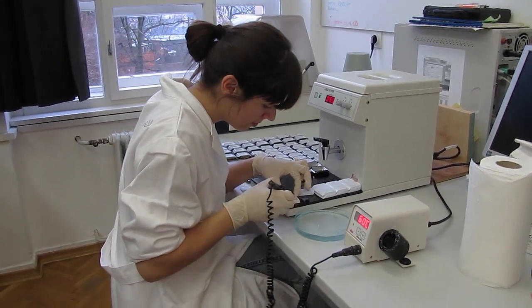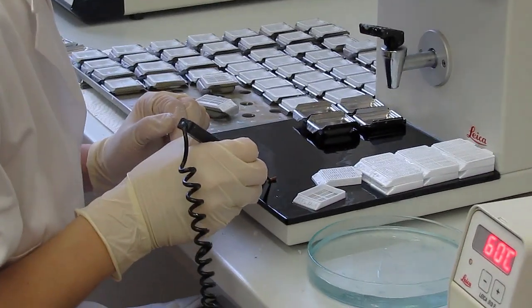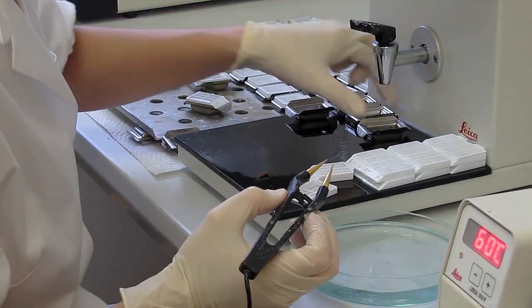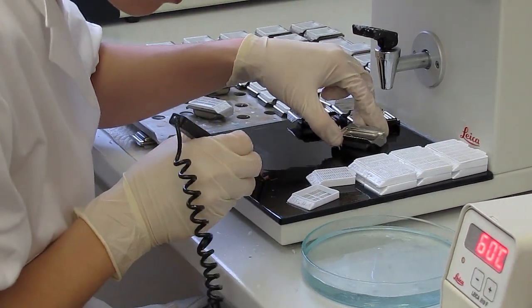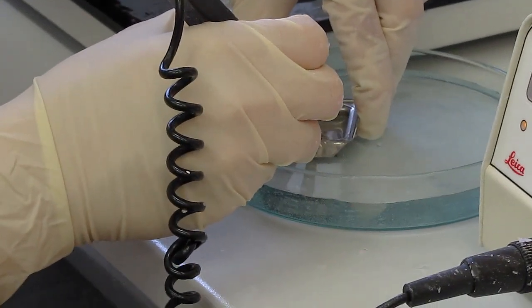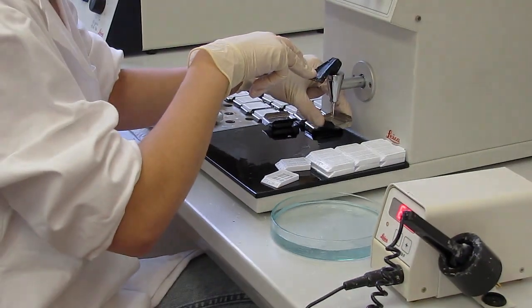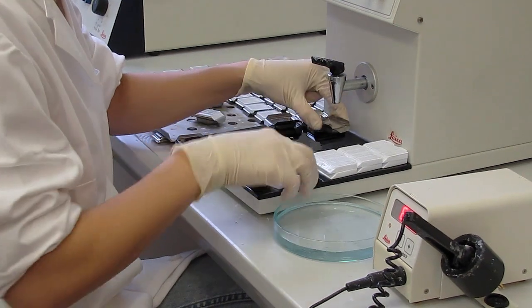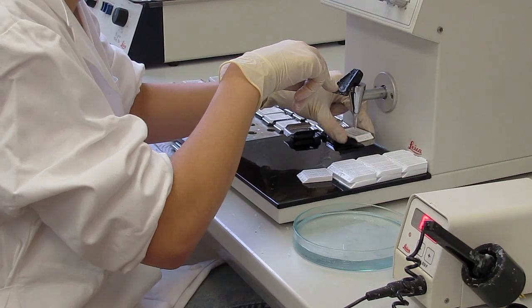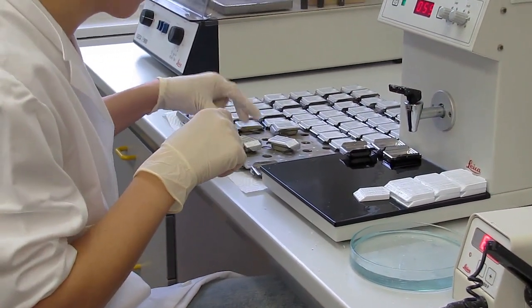Before placing a microcore into the mold, a small amount of paraffin should cover the bottom. Then the sample is placed into the mold in a diagonal direction, and the bottom of the mold should be immersed into the cold water so the paraffin can harden. This will stop any further movement of the microcore. When the mold is full, the main part of the histoset is placed on top of the mold and filled with additional paraffin.